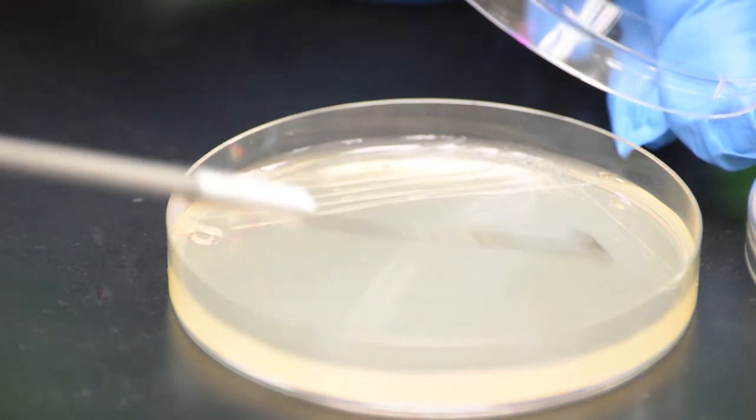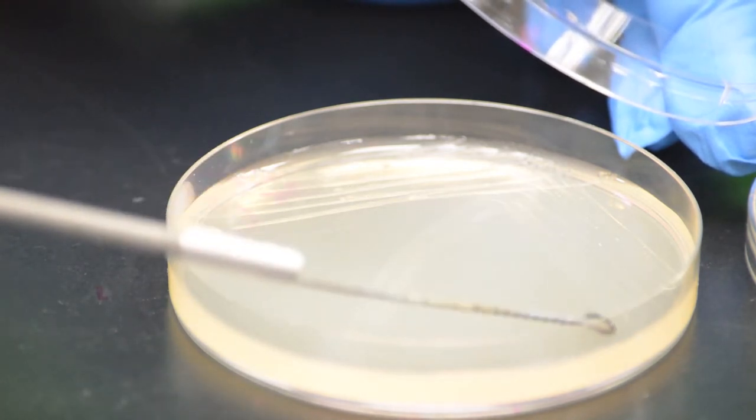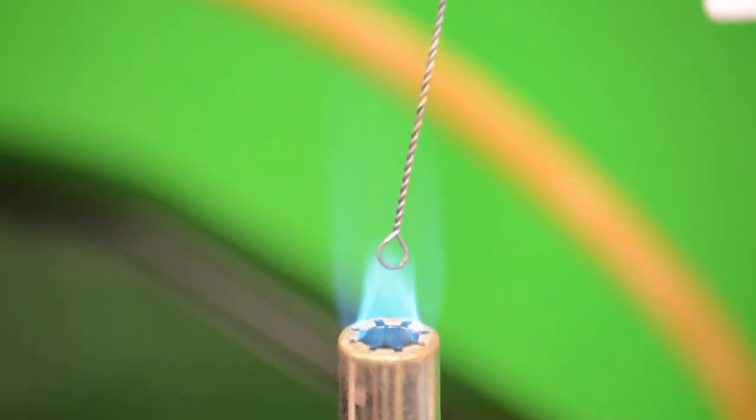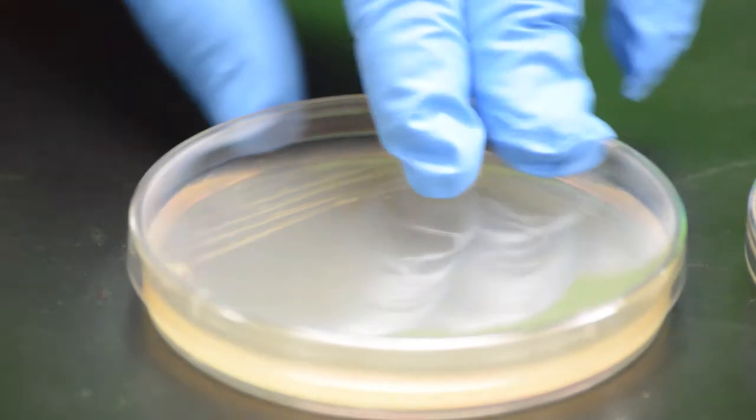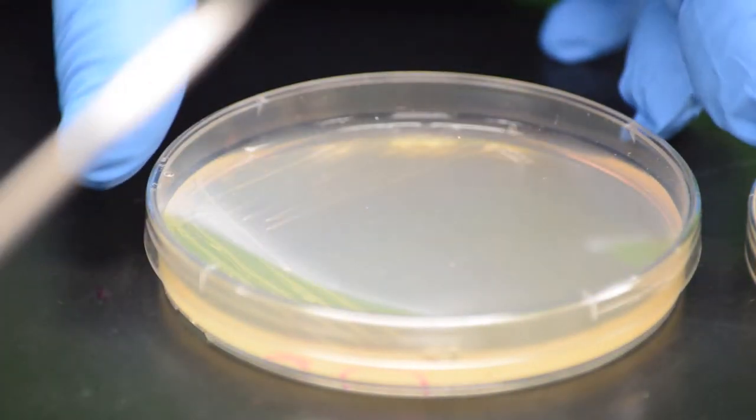Repeat those steps: flame the loop, let it cool, touch the last set of streaks, and zigzag to spread the culture over the next quarter of the plate.